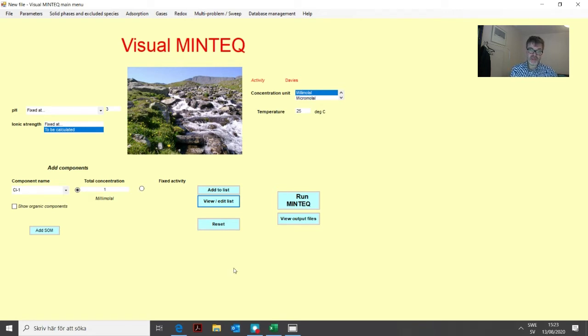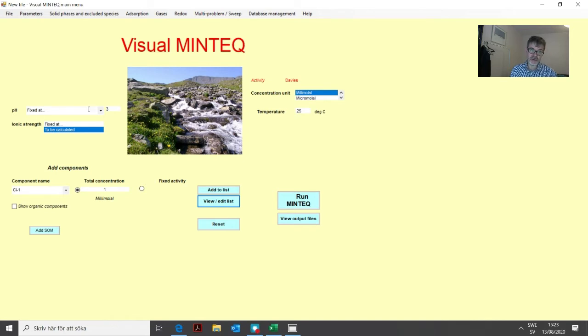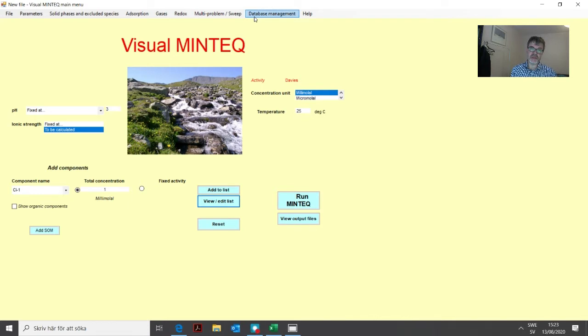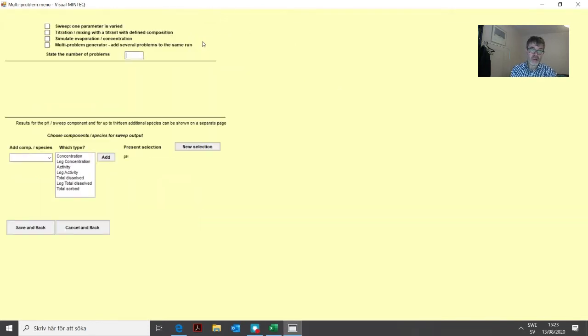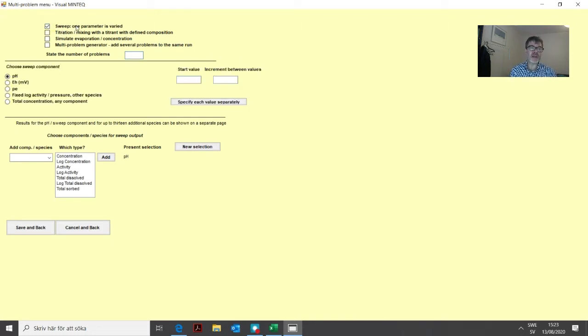Now we have basically defined this problem for one particular data point at pH 3. Now we will add a number of other pHs to this problem so we can see how the zinc adsorption depends on pH. So it's time to go into the multi-problem sweep menu and choose the sweep one parameter is varied option.